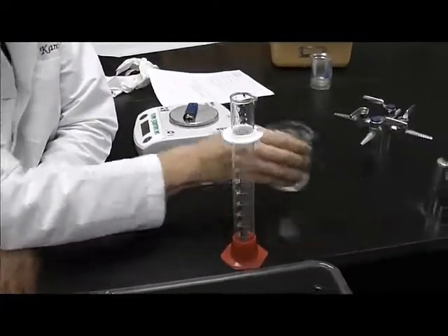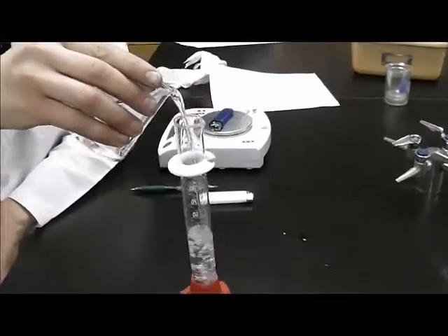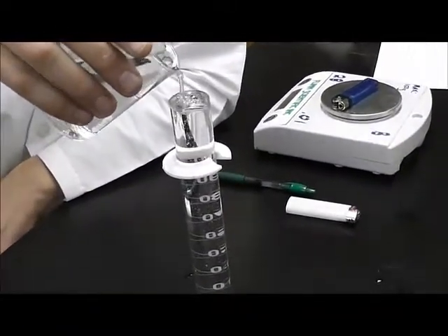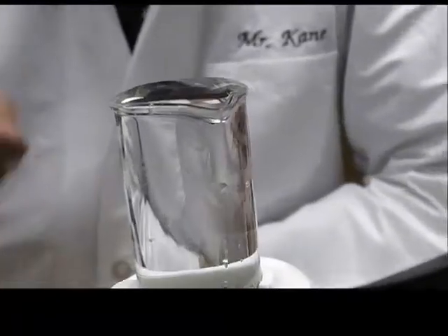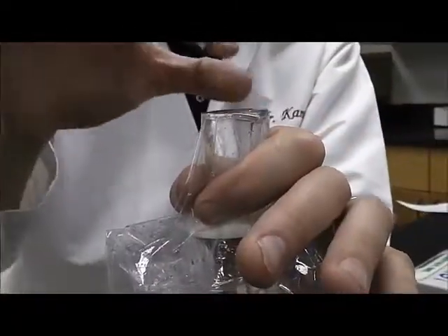And you need to prepare your graduated cylinder. You want to be sure to fill this graduated cylinder as high as possible. Notice that it's actually a little bit overflowing. What we're going to do next is take some saran wrap and put it over the top. You don't want to push the saran wrap down, because then you'll get bubbles.